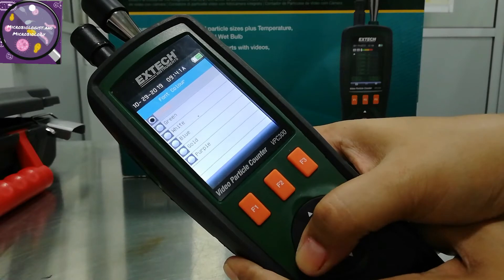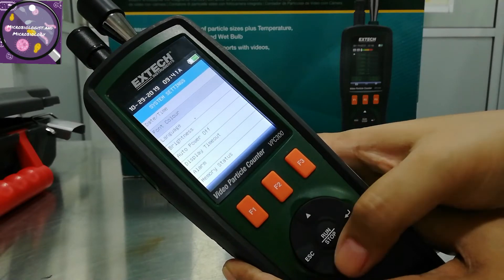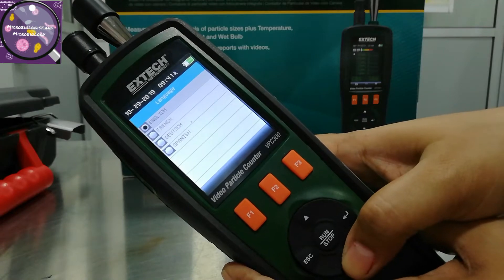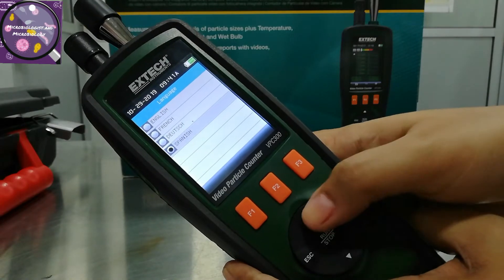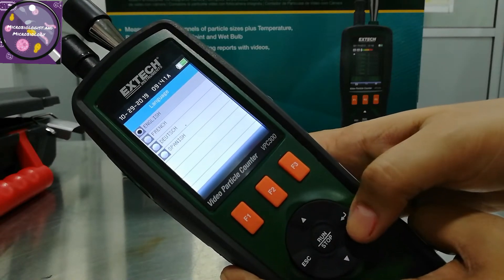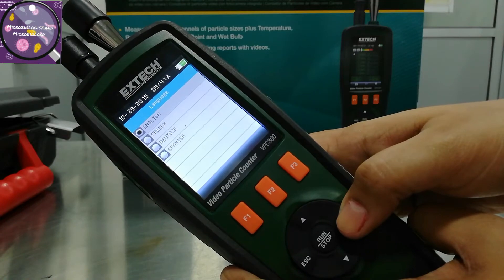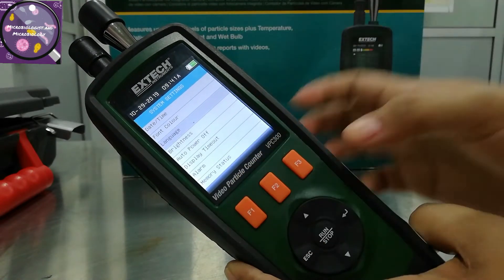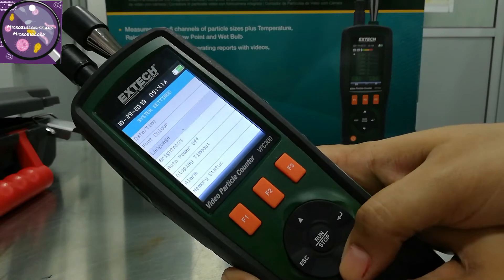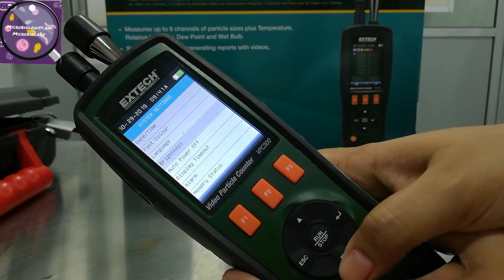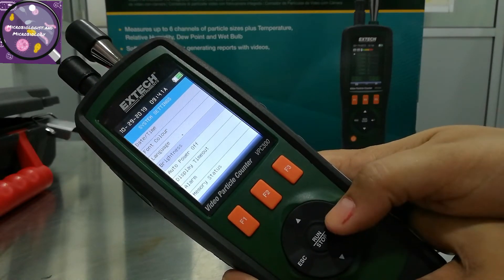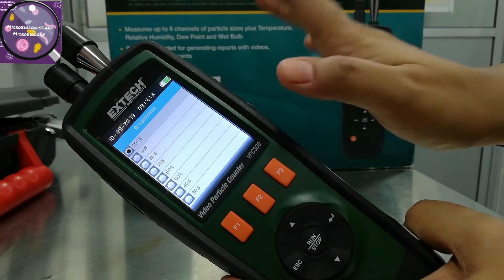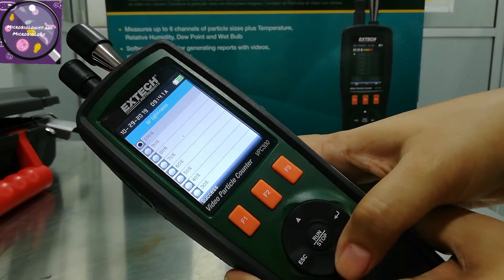It's just a general function key. Language may be a useful setting, but in Asia we must use English. The other option is brightness, where we control the display brightness — right now it is at 100 percent.